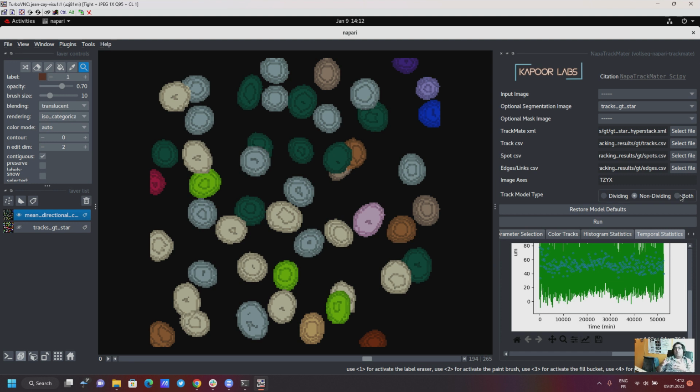So then there would be more blocks which contain the distance of your cells to the tissue. If you upload an optional mask image, this is supposed to be the tissue which is around your cells, and I can calculate the distance from the cell to the tissue boundary. So that will give you whether your cell moves with the tissue or not. And then there would be more blocks which I will keep updating you on once I make them.